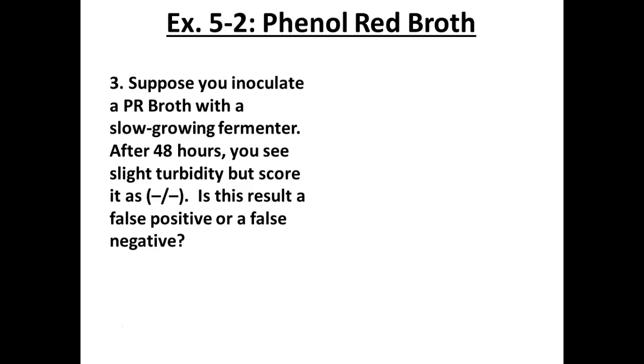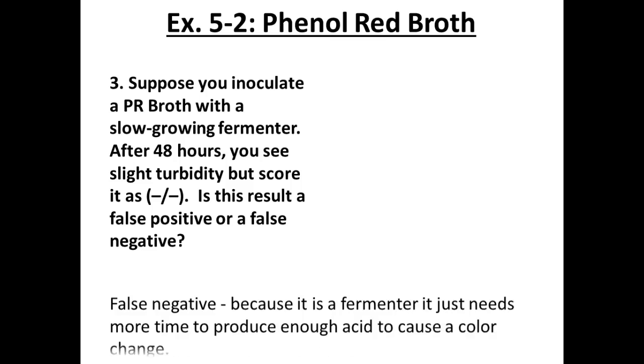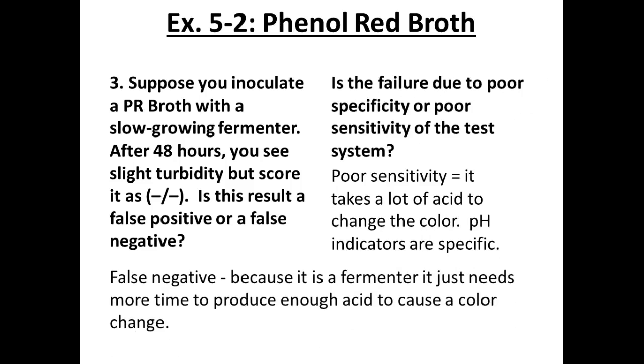Would this be a false positive or false negative? False negative, because I told you it is a fermenter, so it should be what? Positive. What's the problem here? Sensitivity, right? He's too slow. He's not producing enough acid for that pH indicator to change over.